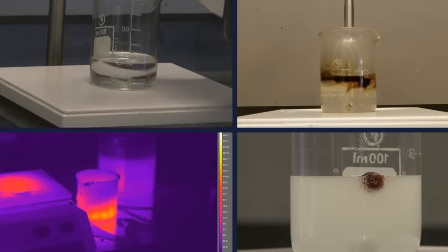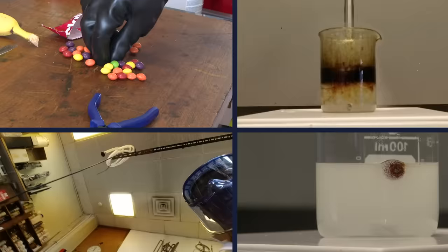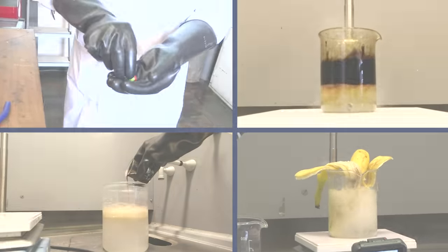In our previous video about Piranha Solution, we submerged all sorts of things from skittles to bananas. But today, as promised, it's our traditional chicken leg.